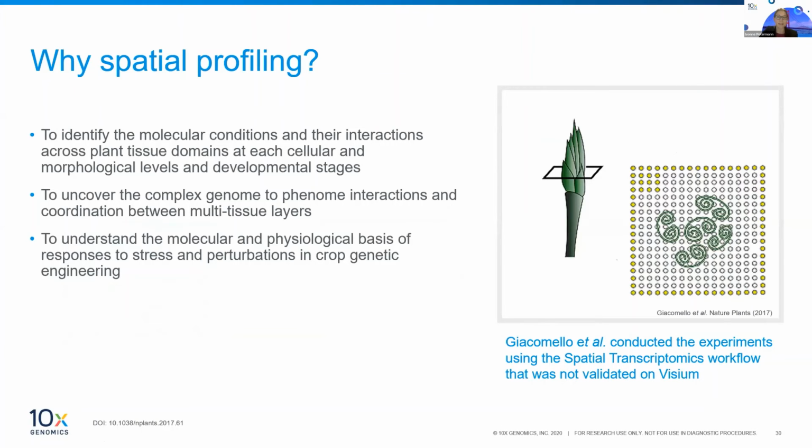And lastly, what I find specifically very exciting is the fact that scientists make this work on plant. It is not a supported 10x workflow at this point, and that only means we have not tested this in-house and validated the protocols, but we are now seeing it actually works really quite well for specific plants.